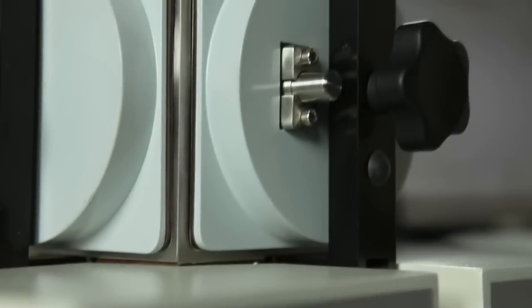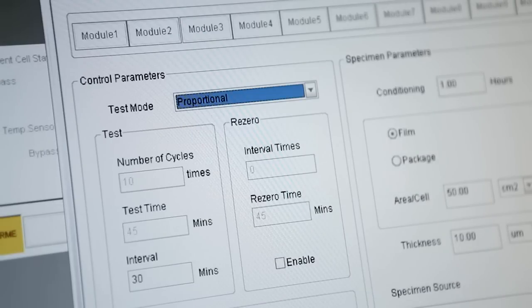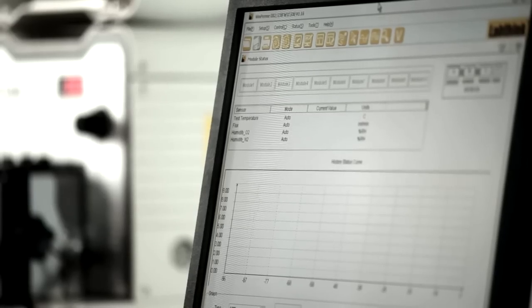The constant temperature and humidity control function, proportional, continuous, and standard testing modes, facilitate to minimize errors caused by human factors during the testing process.